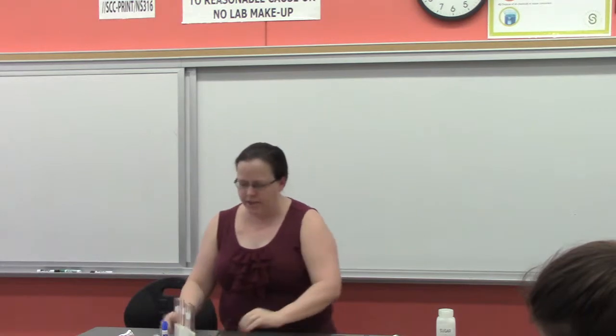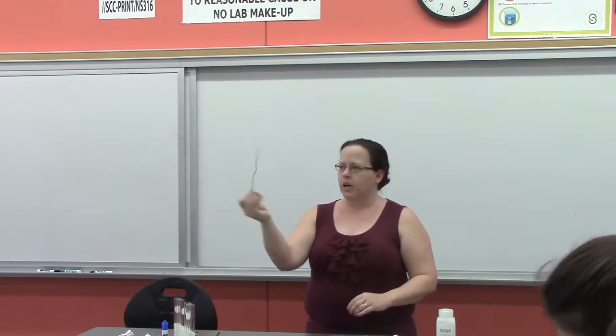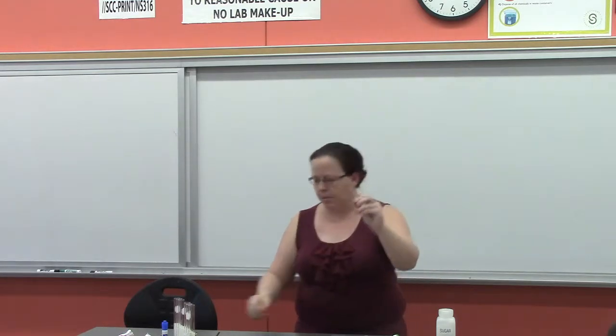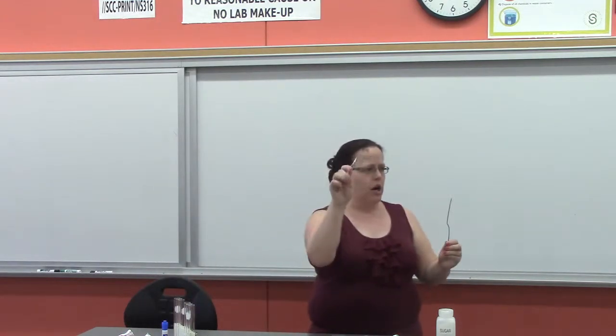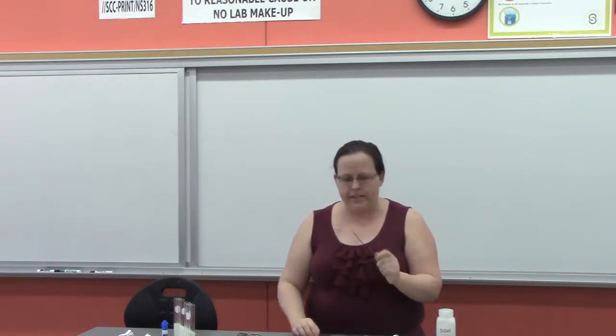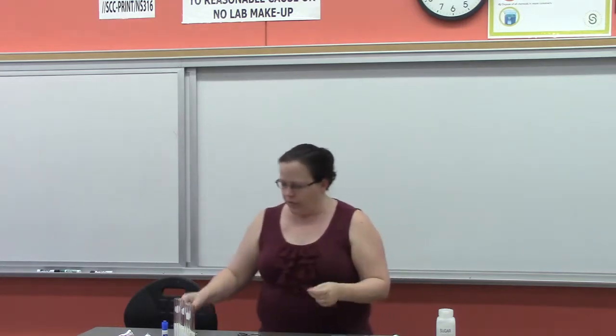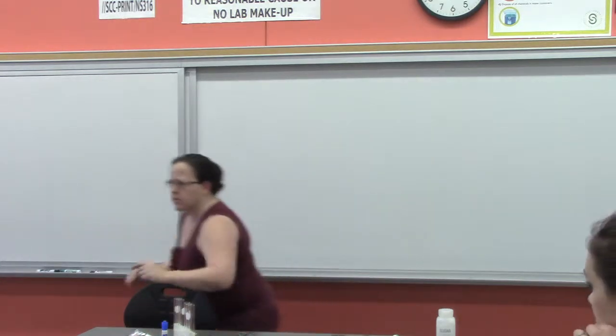Last test that you're actually going to be performing is our copper. So we have these little copper wires and we have tongs. Okay? It says sand the end of a copper wire until it is shiny like a new penny. So right now they're kind of cruddy. If we take sandpaper, there's sandpaper back here.